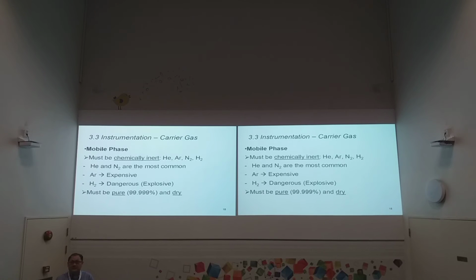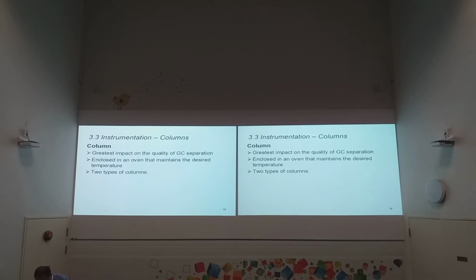Another requirement is that this gas must be very pure and dry. That's why we can give you a good separation.